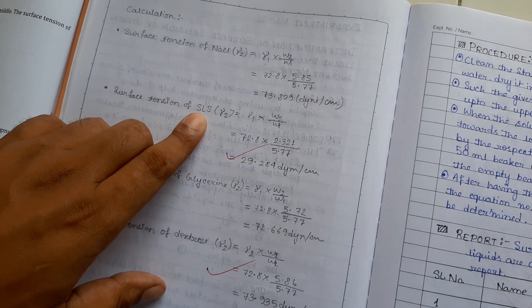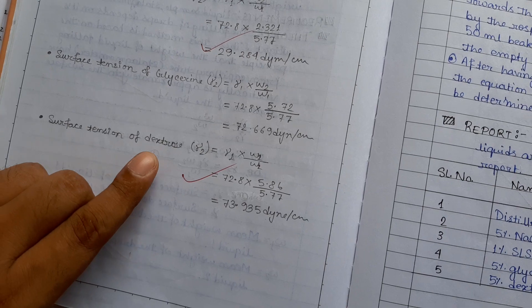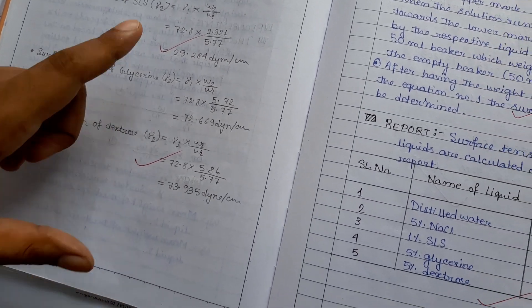Like that, for 1 percent SLS, 5 percent glycerin and for 5 percent dextrose, you have calculated the value.